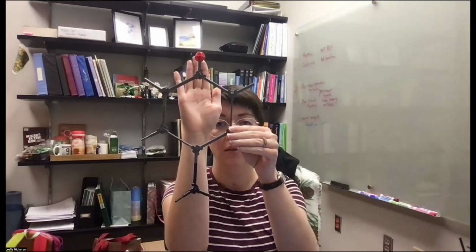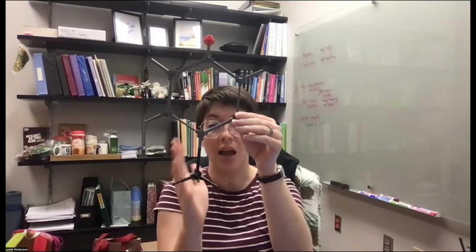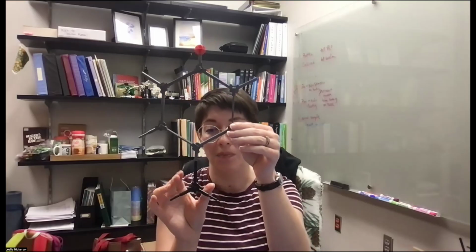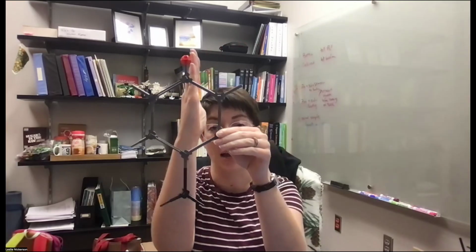If I went and changed to something like that, I would still have a plane of symmetry right there, right? Because I can line this up so that it is going to be mirroring itself no matter kind of what I have over here. We're going to have that plane of symmetry right there.